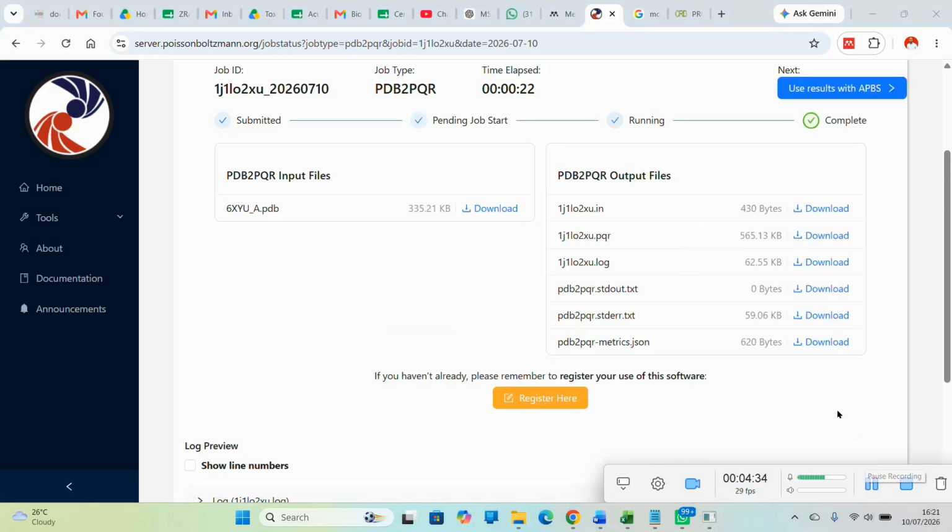Okay, you can see that our interest, the PDB2PQR work, is completed, and you will see it here, the .pqr file. So you download, and that's now downloaded. Normally it will give it a kind of code, just note it in case you're working with several compounds. Now we have 1J, 1LO, like that. Just note it and then ensure that you're using the right one for your work.